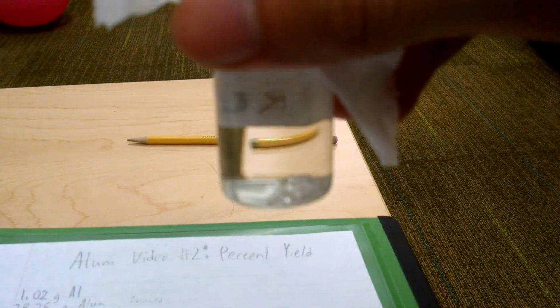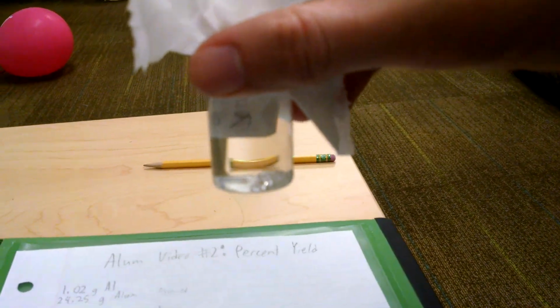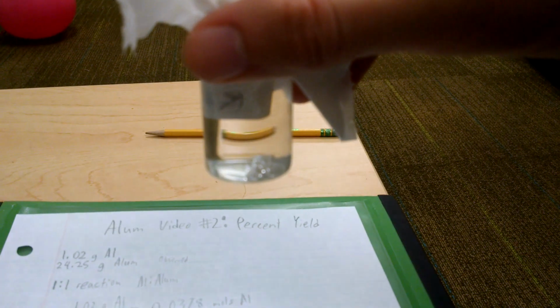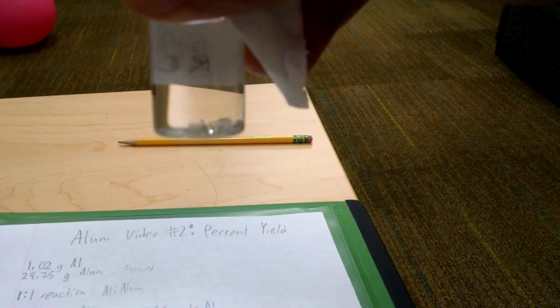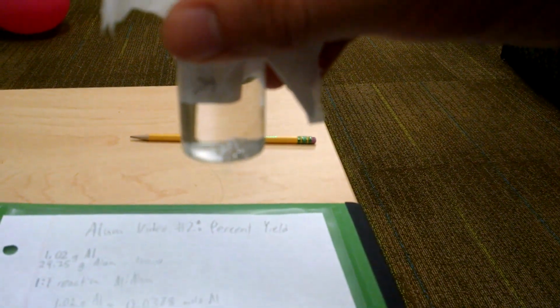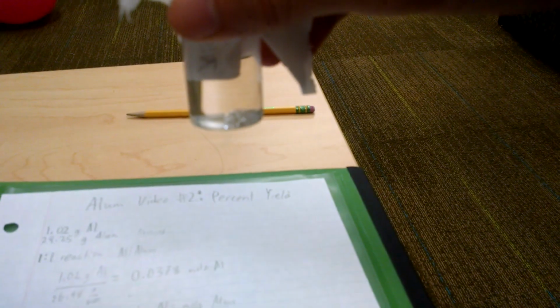So, start off by taking a look at the crystals. So here are my alum crystals. Can you kind of make them out there? These crystals are being formed through slow evaporation of the alum liquid, which is forming a nice, crystalline structure. These ones are a little bit cubic, as you can make out.